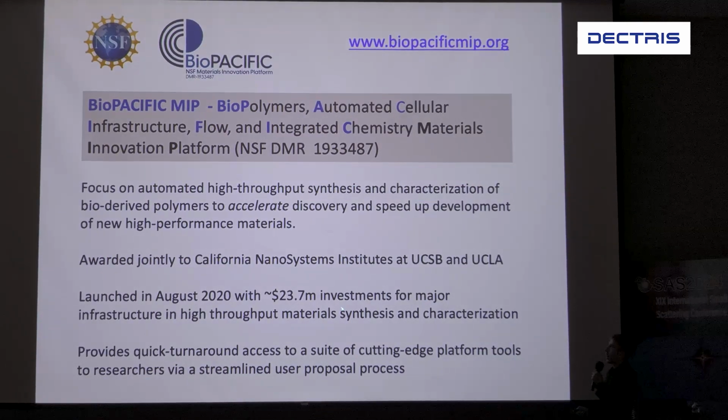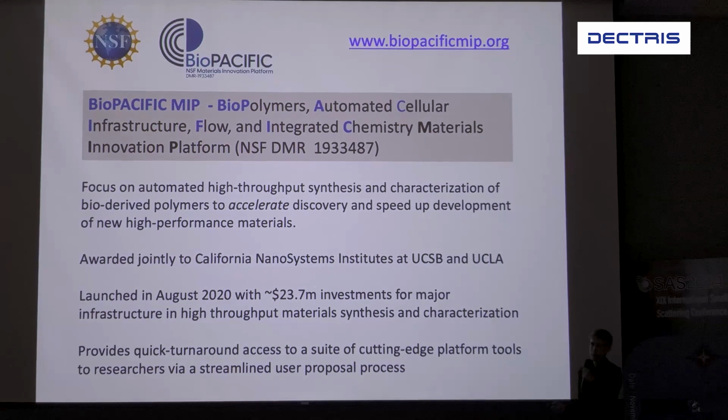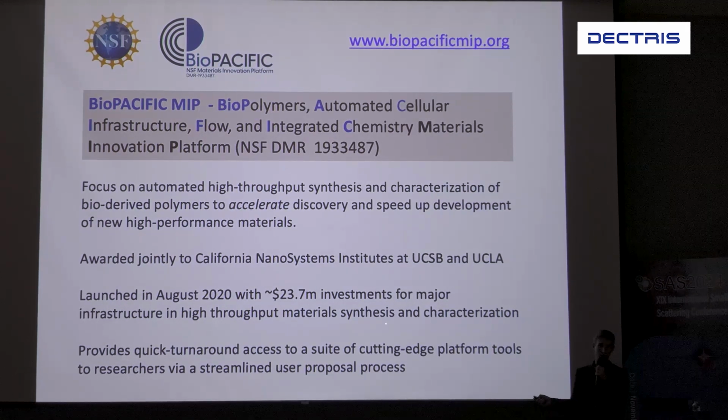So I am here to talk mostly about Bio-Pacific MIP. So what is Bio-Pacific MIP? NSF gave UCSB and UCLA a pretty large sum of money, $24 million, to buy cutting-edge instrumentation in order to characterize materials, anything that's biologically inspired or biodegradable. If you have that kind of research, you can use our facilities for free.